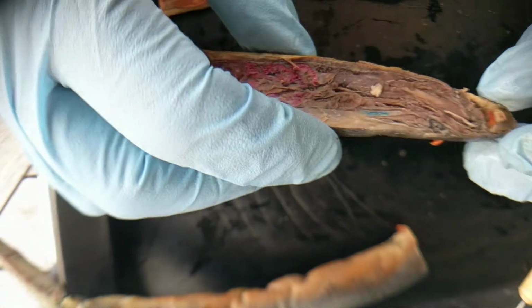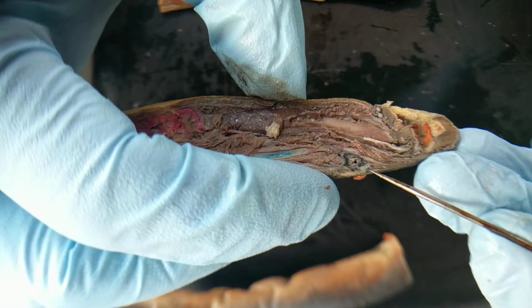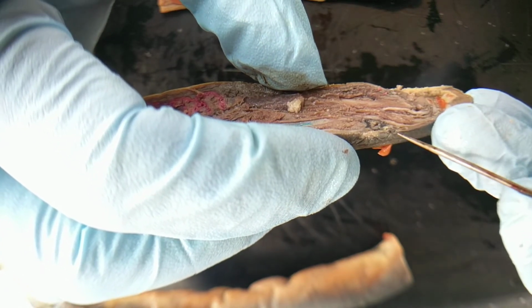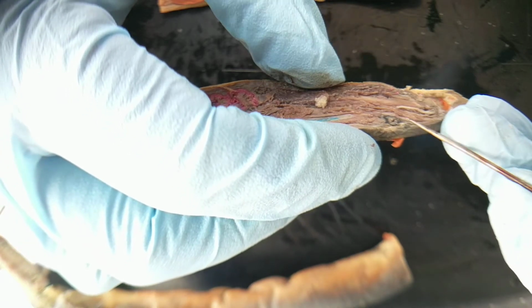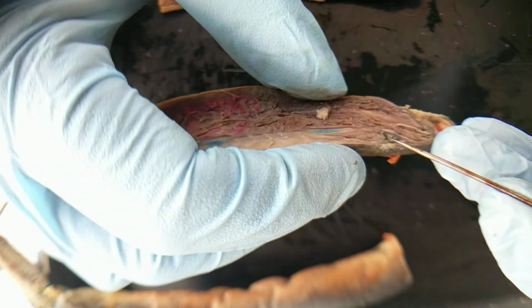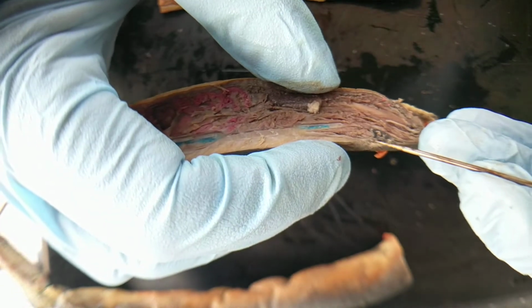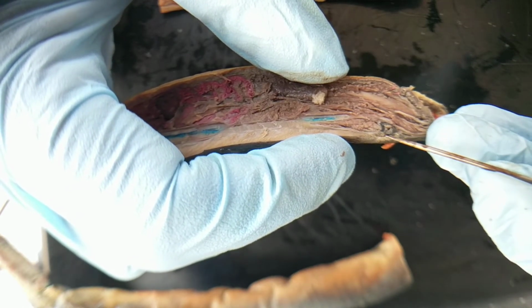All right, and then we can see that opening again that I told you, that nasopharyngeal opening. Let's see if I can get it in sharp focus here. The opening should be about here. It's right in there. And just behind that is the pineal gland. You can see, I think, the lighter colored skin in the back, and just under that is the pineal gland. So this is the nasopharyngeal duct here, pineal gland here.